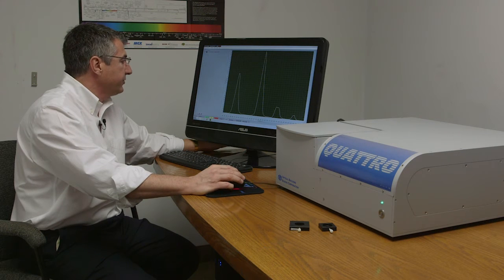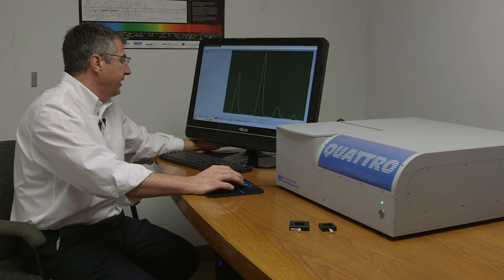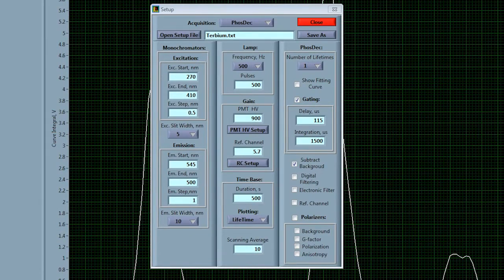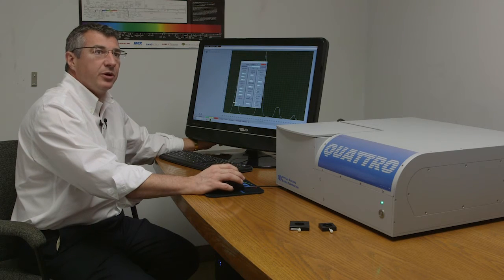So right now we're going to actually do a quick decay measurement of this same sample. Here I'm going to actually now open up a setup panel on the screen and in this setup panel we're basically able to adjust all of the parameters for virtually any kind of a luminescence experiment that we're interested in doing.